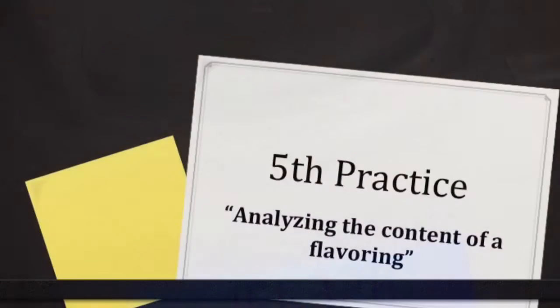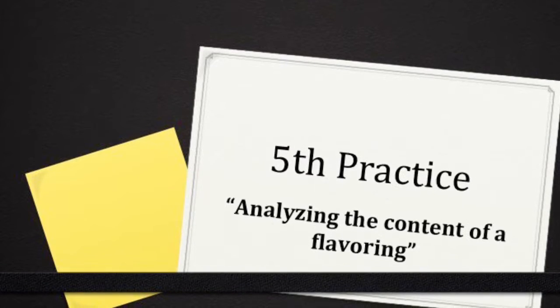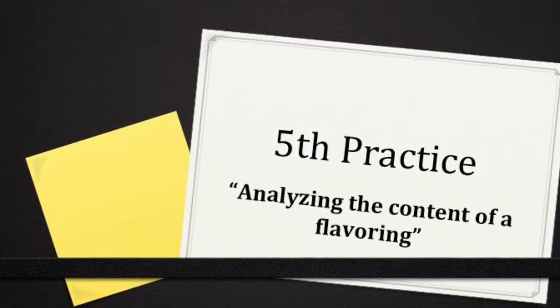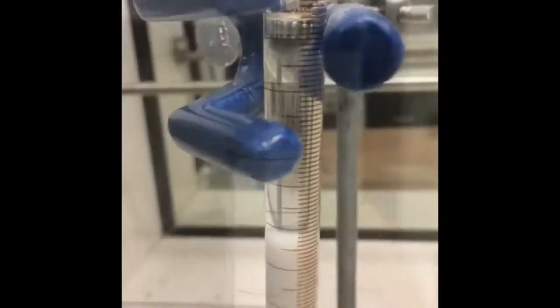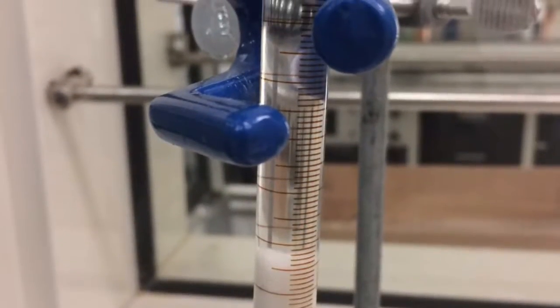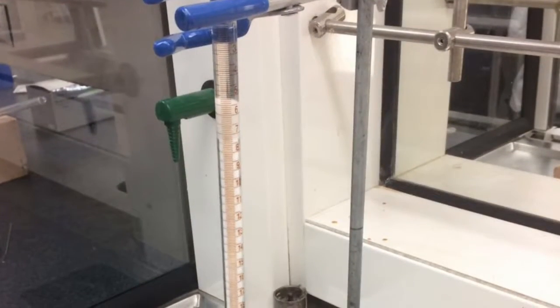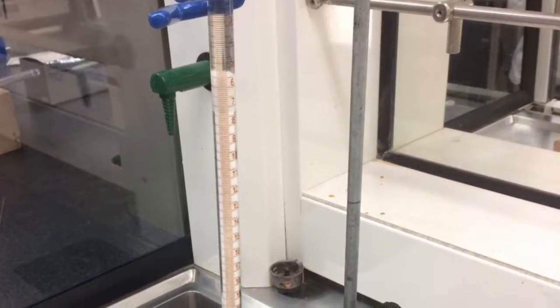The fifth practice was about chromatography, and chromatography is an analytical technique used for separating mixtures of chemical substances. The main purpose of this practice was to separate the compounds of the flavored drink and of some color. For the color chromatography, we could notice that it's very delayed, and we could finish this method.